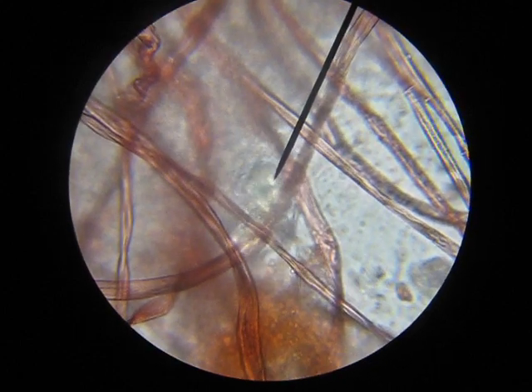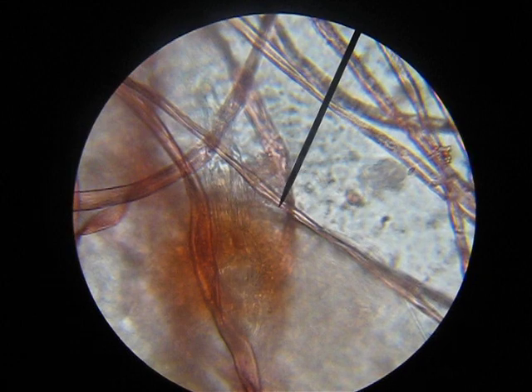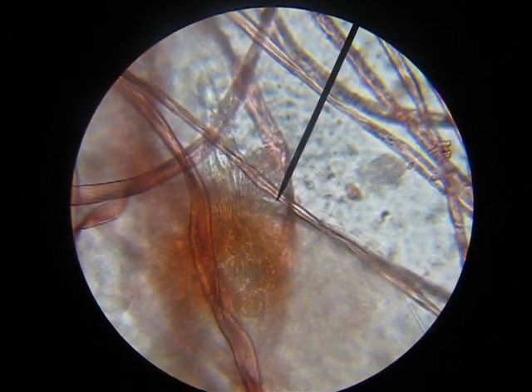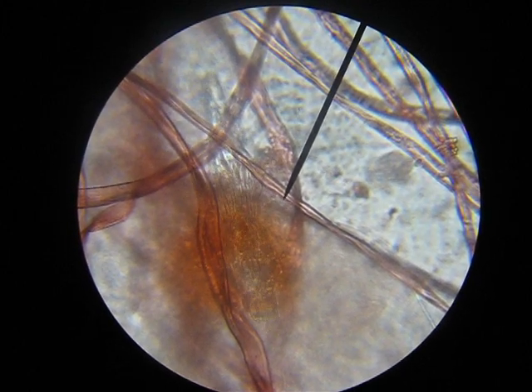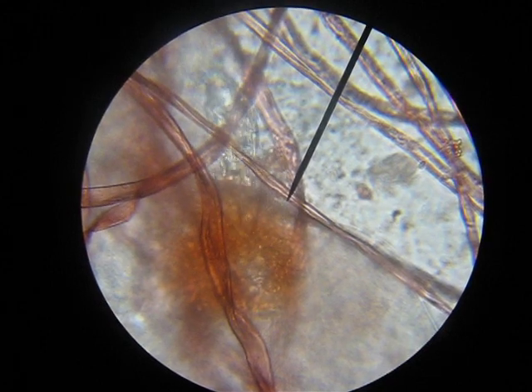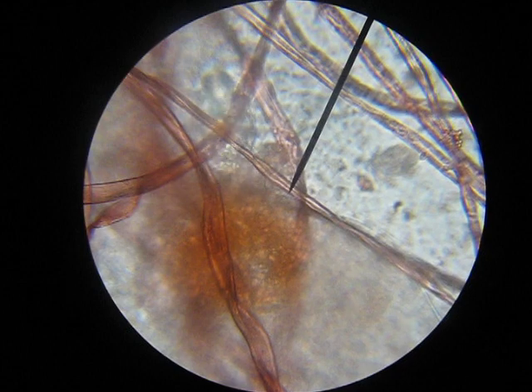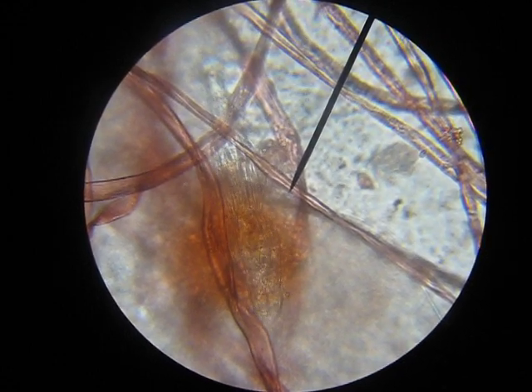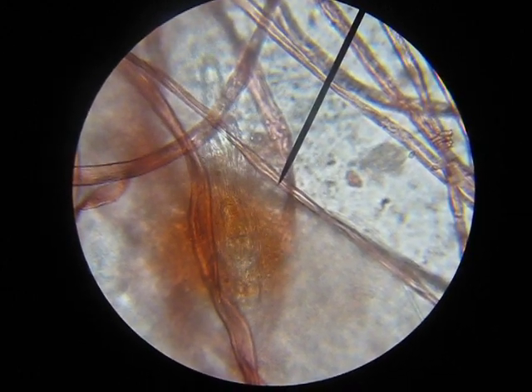It might be kind of a concentration of yeast or something. It's like perfectly trapped. Alright, maybe we'll call that good. That's like five minutes.